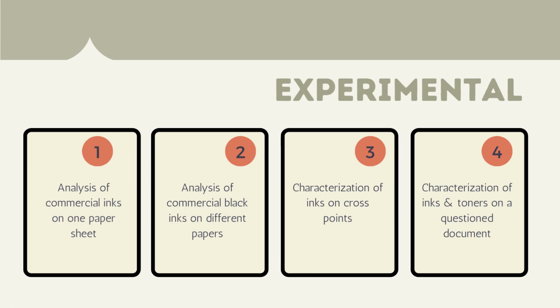In this paper, the researchers tested LIBS for all relevant issues in forensic examination of commercial inks, including the classification of pen inks on one paper type and also on different paper types. The third analysis is determination of the deposition order of layers of ink, and the last analysis is the analysis of signatures and toners on a questioned document.